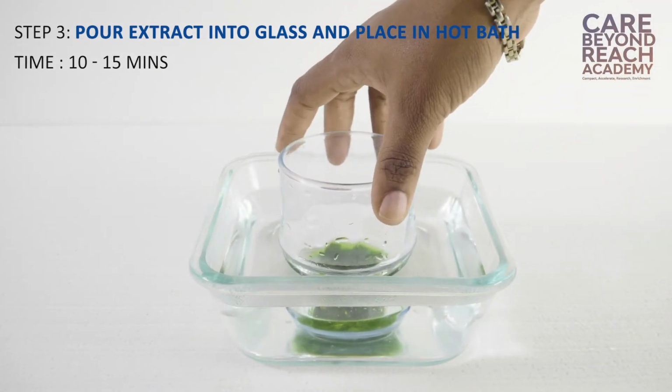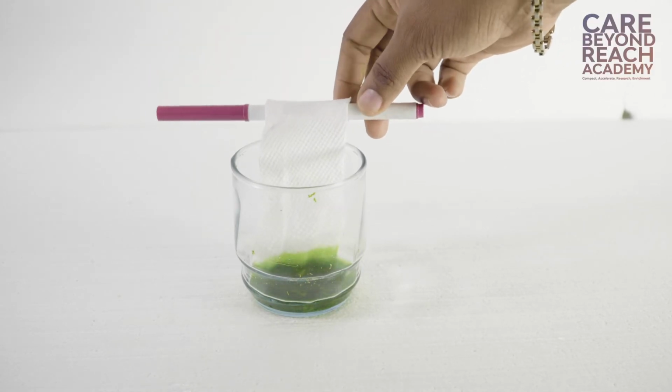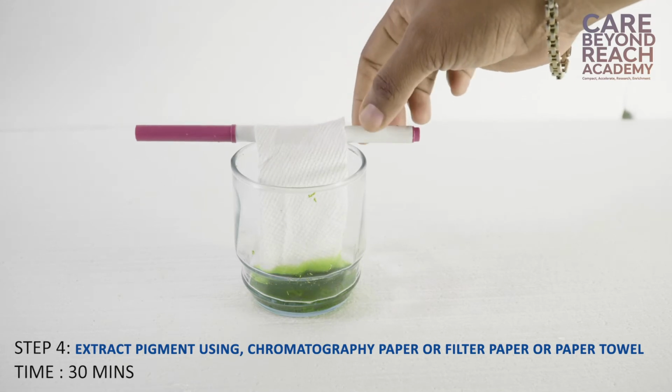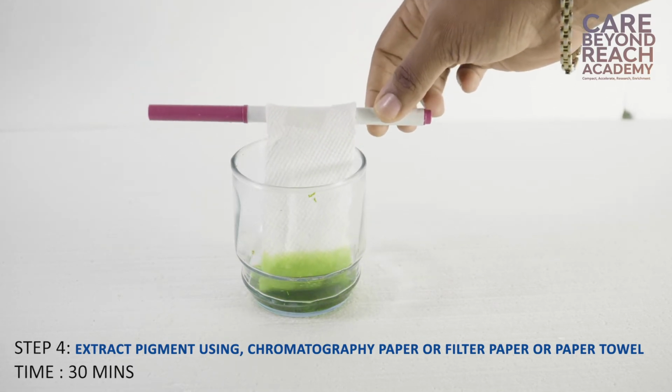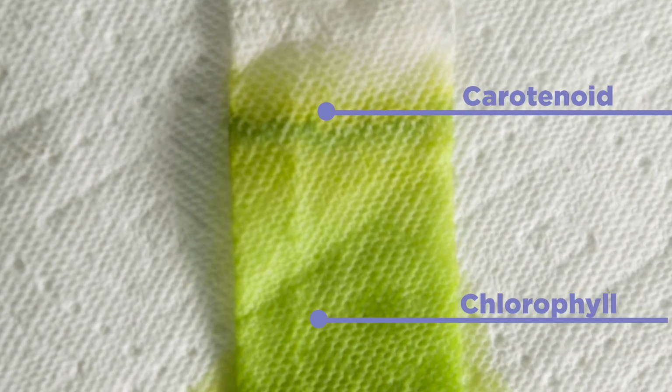We let it sit for a few minutes. Once we have let it sit for a few minutes, we then get our paper towel or filter paper or chromatography paper and now leave that for roughly 30 minutes, and then we can see the results with the two bandwidths with the chlorophyll and the carotenoid pigment.